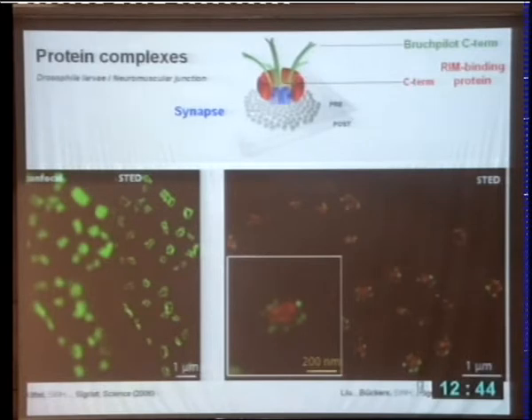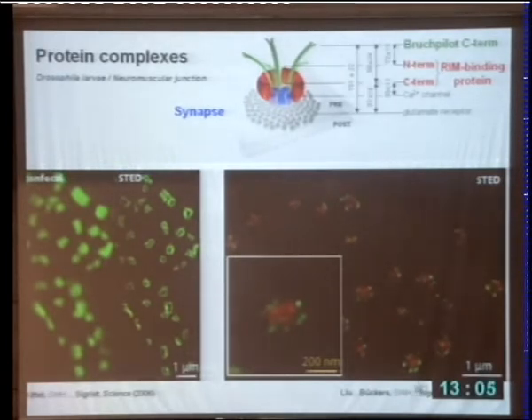Now, collaborating with him more recently, we labeled different proteins or different protein ends, and of course you can find their arrangement in space. It is a comparison with confocal after mathematical treatment, which never gets as good as STED after mathematical treatment, obviously. And so you can get from your data a three-dimensional model of the protein arrangement.